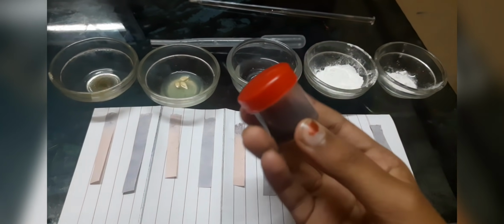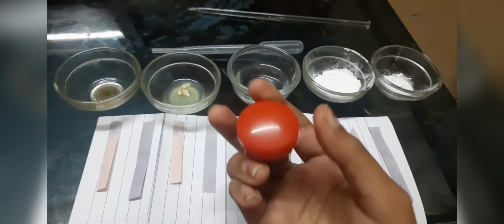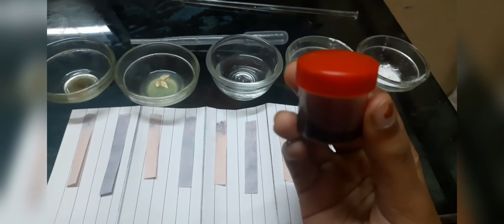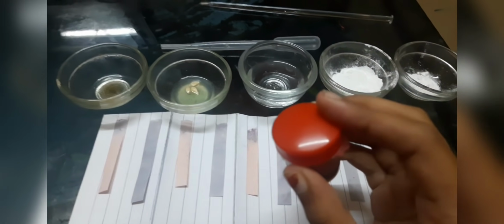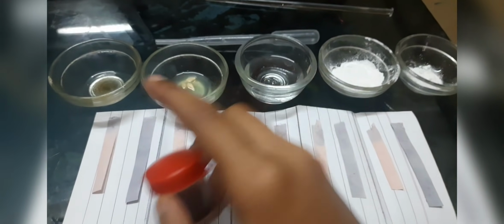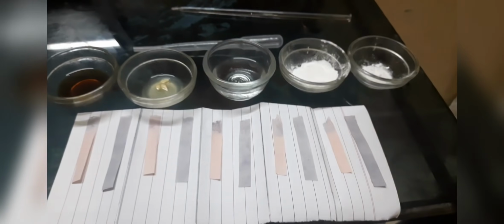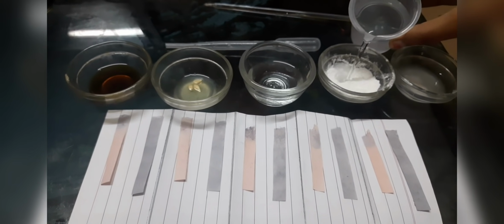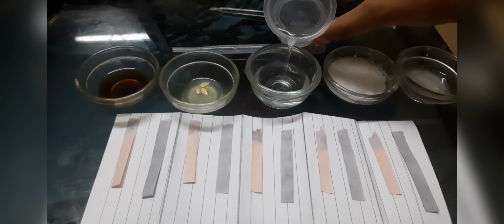And the next sample is phenol. I will store it over here. Most phenols are stored in glass containers, but this phenol can be stored in a plastic container too. So we will add it. Now we will dissolve a little water in each of the solutions, because we will make each solution a diluted solution.